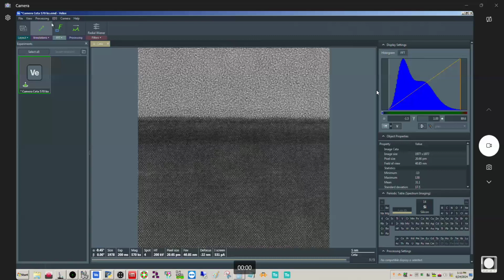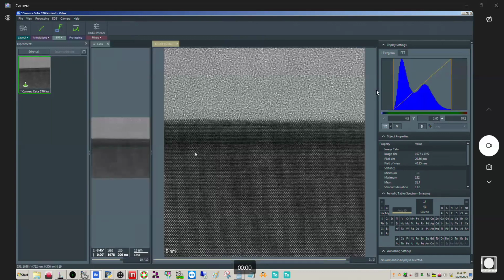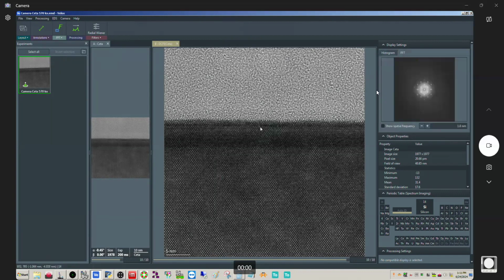Okay, and then while this is happening, this was a trick I saw, we can actually do this. So DCFI, optimize for periodic images, then it's going to sum up my individual frames. And there we go. Okay, beautiful.